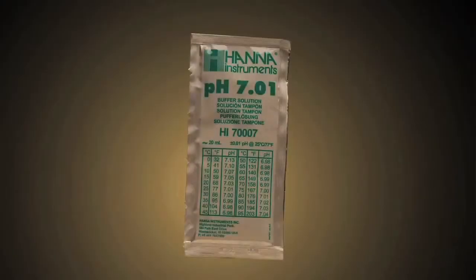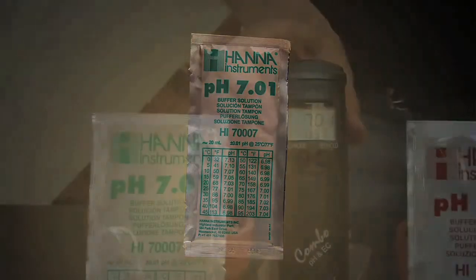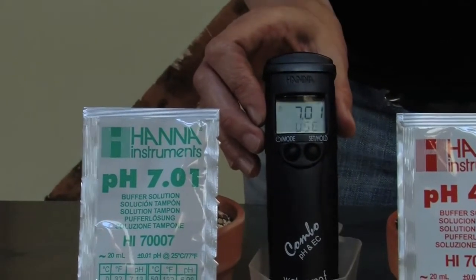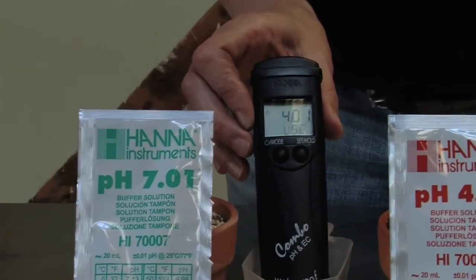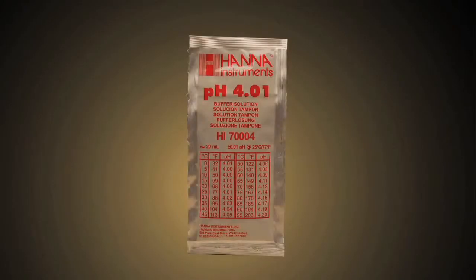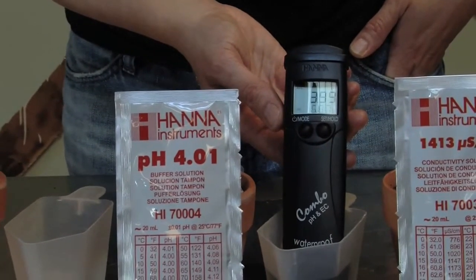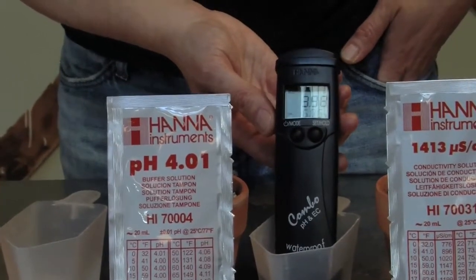To enter calibration, hold the power button until the pen says Cal. It will automatically say use 7.0. Put it into the 7.0 solution — it'll take a few seconds, maybe even up to a minute. After that it'll say use 4.0. Place it in the 4.0 solution, again waiting a few seconds up to a minute. The pen is now calibrated.